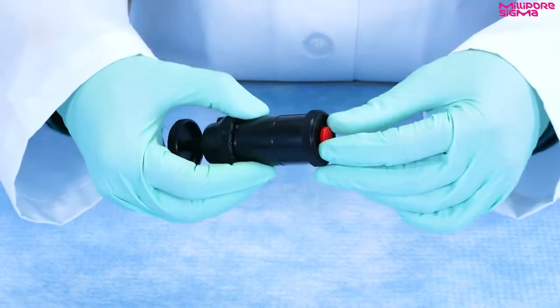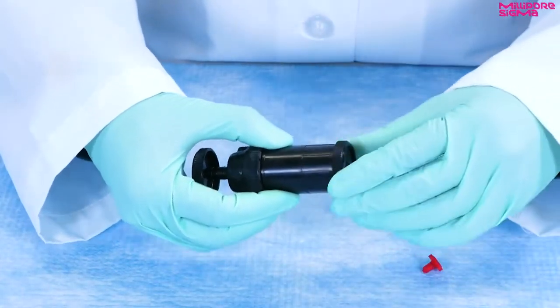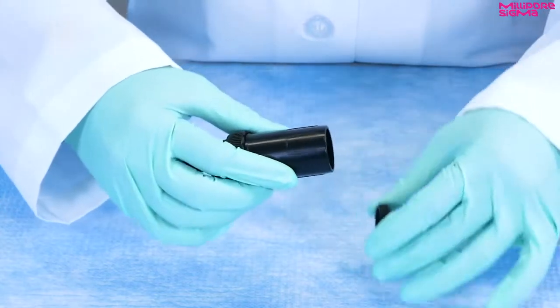These are supplied pre-loaded with the membrane. Let's take a look inside this monitor. These are available as a three-piece unit with a red plug on the inlet cover.